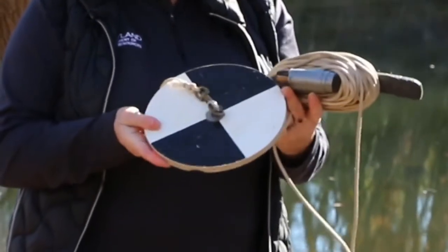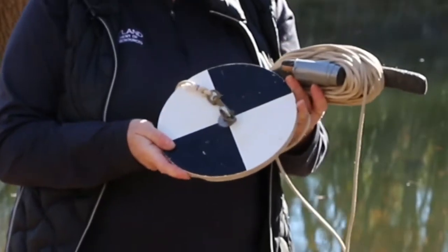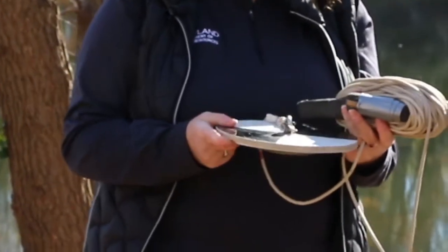A Secchi disc is a round black and white disc that's about 8 inches wide. It has a meter measurement on it.